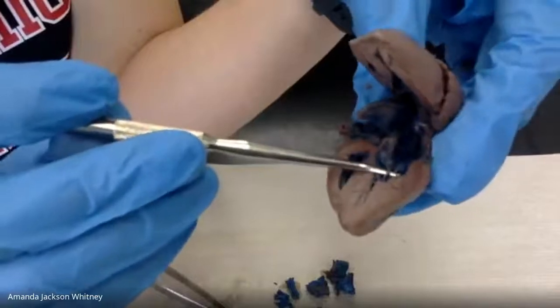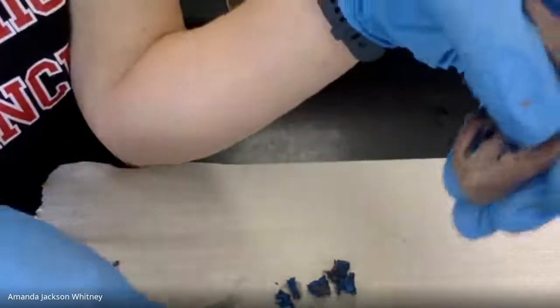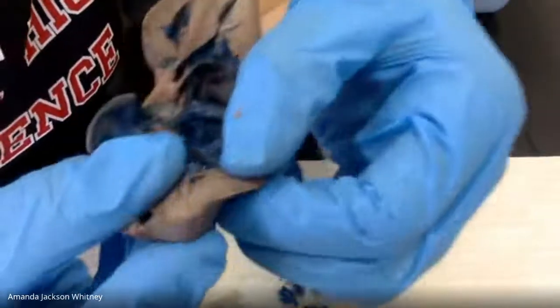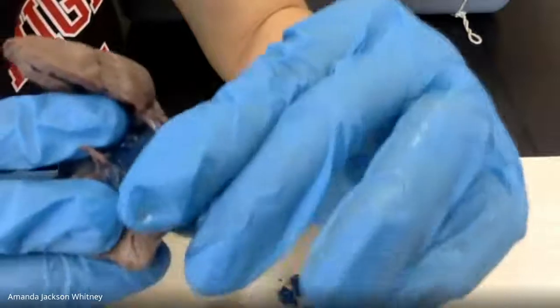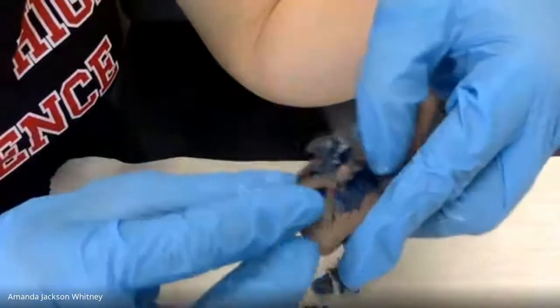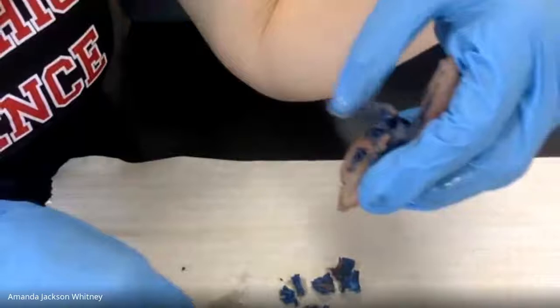So you can kind of see those little chordae tendineae there. Those are the heartstrings that are holding onto the valve. And then they're connected to teeny little muscles in the walls of the heart. Again, I know it's not the best view, but like the little bumps that you see down in the ventricles here. Anyone remember what those muscles are called? Sort of the P. Wait, can you say that one more time? Yeah, the muscles that the chordae tendineae are attached to. Does anyone remember what those are called?